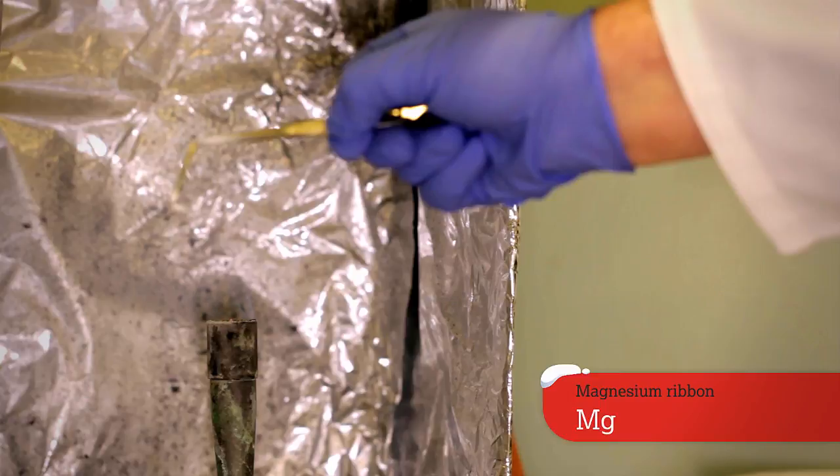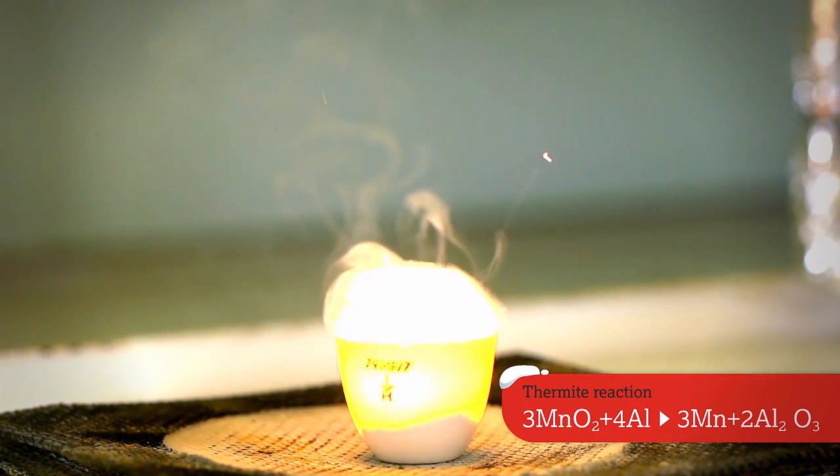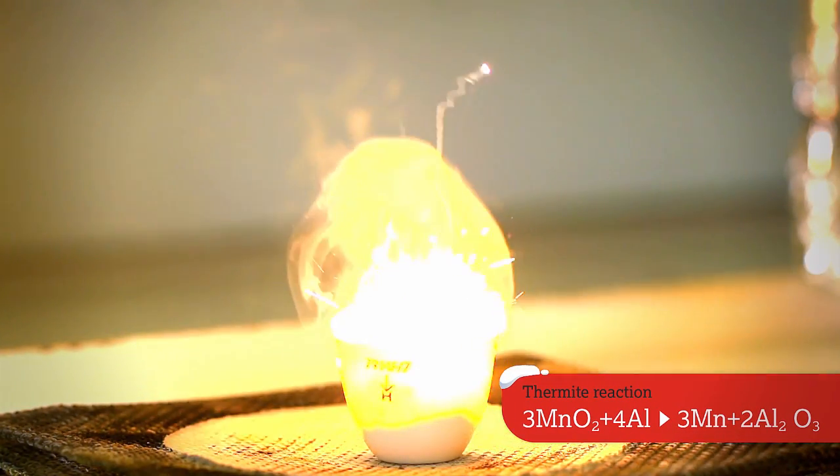And we've got an experiment which is known as the thermite experiment or thermite reaction. And that's been used historically to weld railway lines. We're going to show you a very small amount of that because it's an incredibly vigorous reaction.